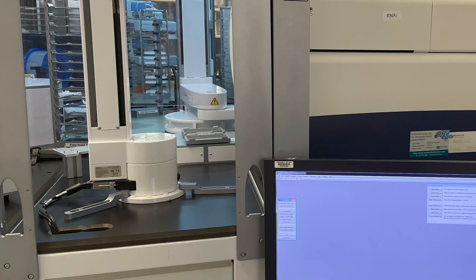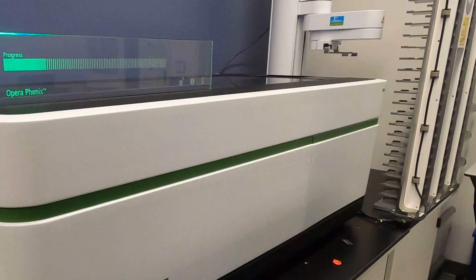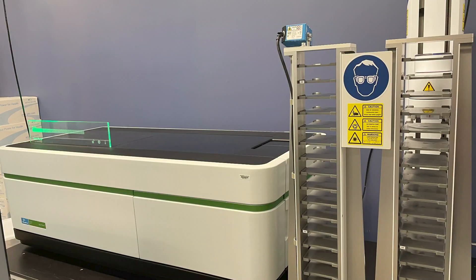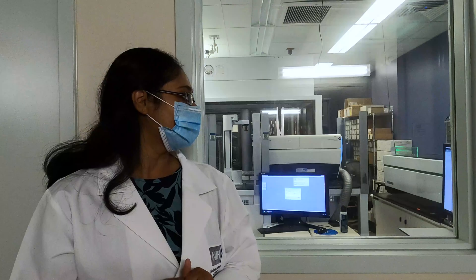As you can see, the arm for the ImageExpress is right next to it over there, and the arm for the Phoenix is on this side. You can see the stackers that can hold up to 25-30 plates at a time. The instrumentation will allow us to analyze the data that we get from these high-content imagers.